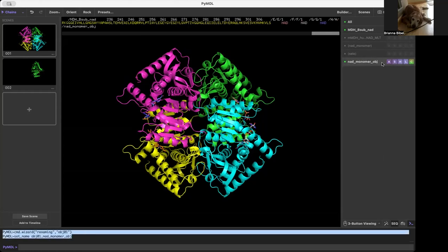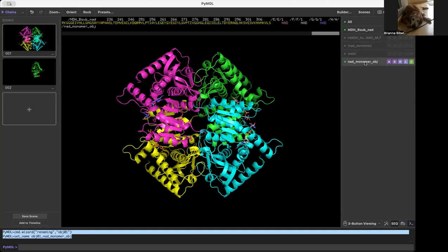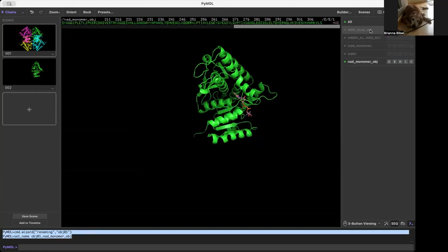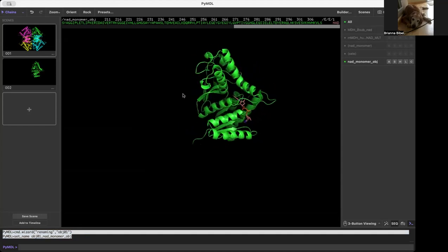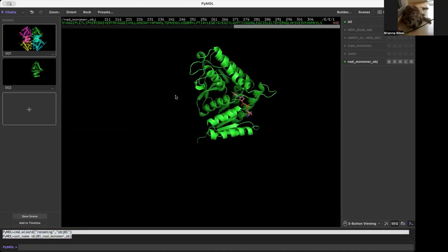Now you can see over here that this is not showing in parentheses. Everything in parentheses is just the selection, whereas an object is independent. I can actually go and unshow the rest of the structure and just have this as a separate object.